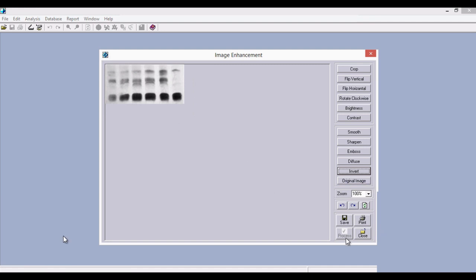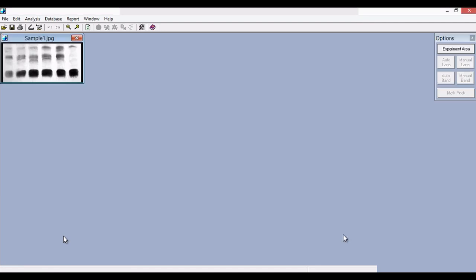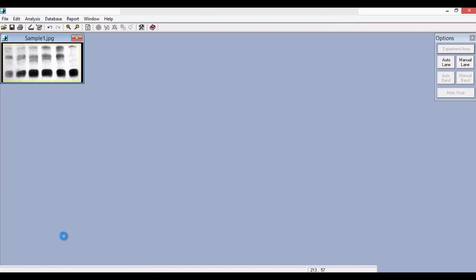After enhancing the image, click on the process button so that the enhanced image is updated. Now we move on to the analysis part. For analyzing, we have to select the experiment area. Click on the experiment area and choose the area. After choosing the experiment area, click on auto lane. You can see that the lanes are automatically detected and numbered 1, 2, 3, 4, 5, 6.